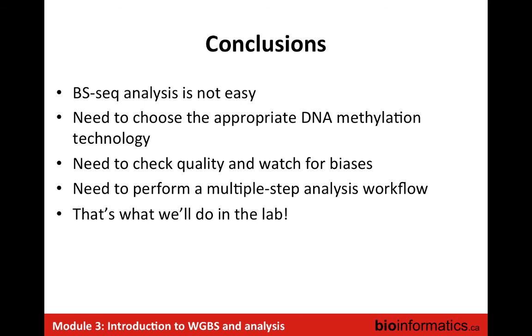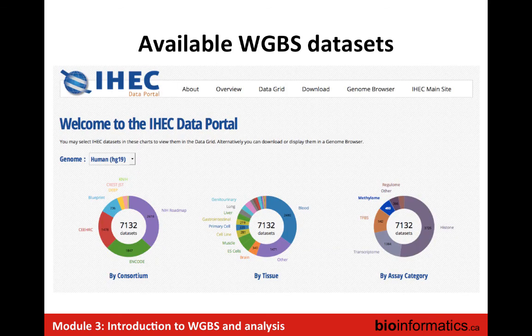There's the multi-step analysis workflow, which is really what we're going to be doing in the lab. Just before we break, a preview of what you'll see in David's presentation. Whether you have some of your own data, or there are also lots of available data sets out there, what we're going to be doing in the lab is a dumbed down version of one of these data sets that's much smaller, such that the processing will be reasonable.